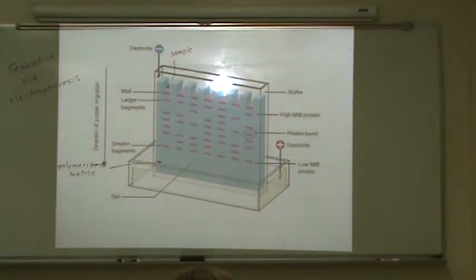If you've eaten Jell-O, that's a polymerized matrix, usually of gelatin, somewhat, and also other carbohydrates that have been dissolved, cooled, and they form some kind of mesh. And it's usually some kind of polysaccharide chains that form a mesh.